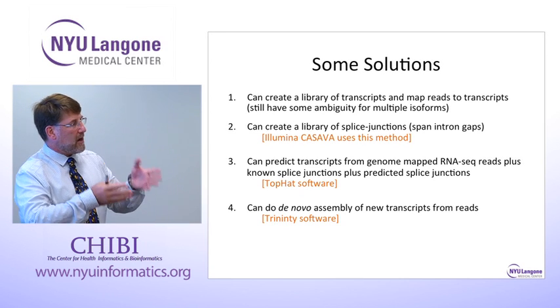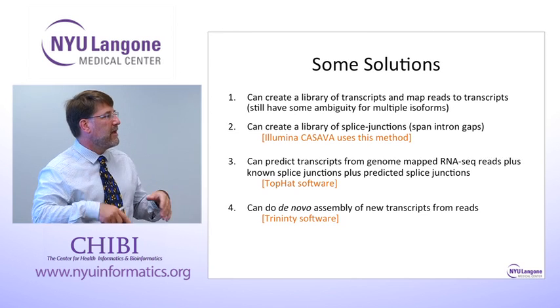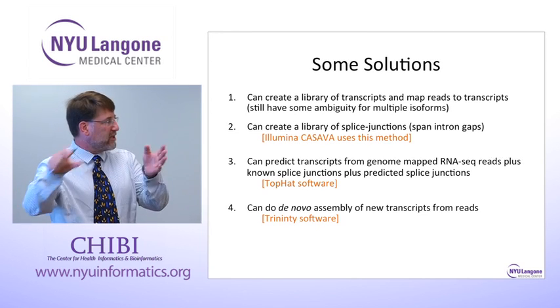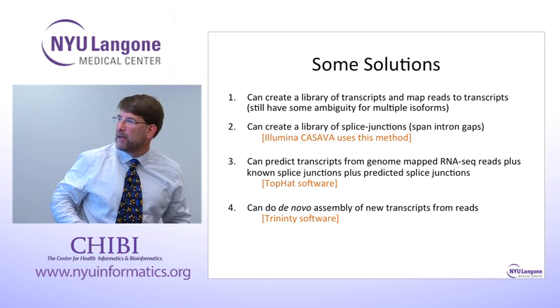Other reads that are in the same genomic position are also tested. And a splice site becomes real when several reads match across that splice position. I got a graphic about that.